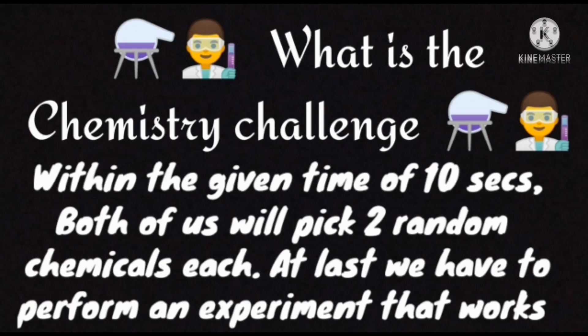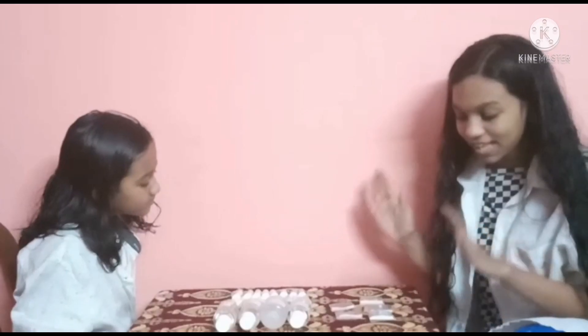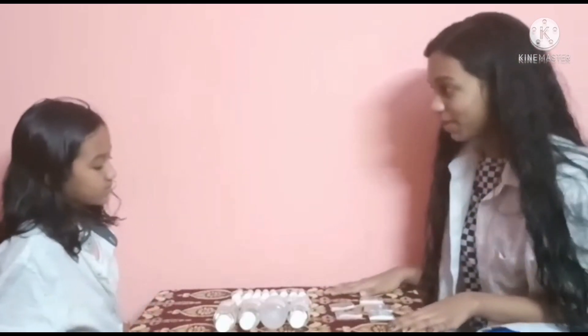Within the given time of 10 seconds, both of us will be allowed to pick two random chemicals each. At last, we have to combine the four chemicals and perform an experiment that works, of course. The experiment has to work right. So, now shall we pick?